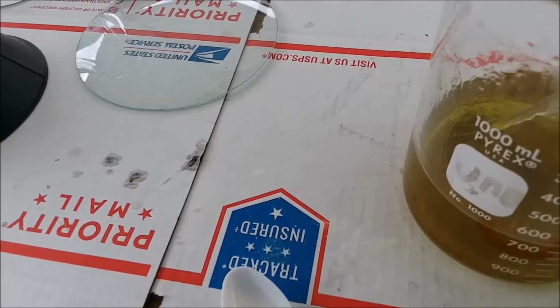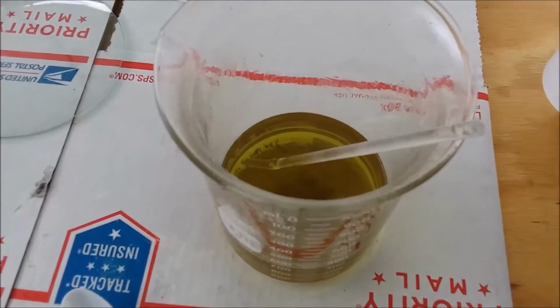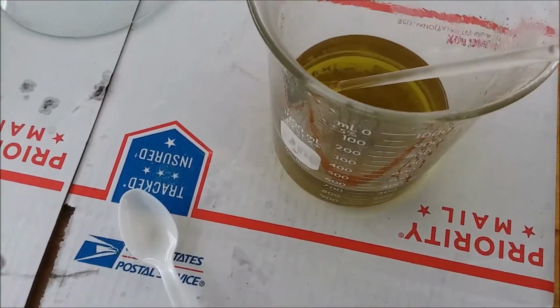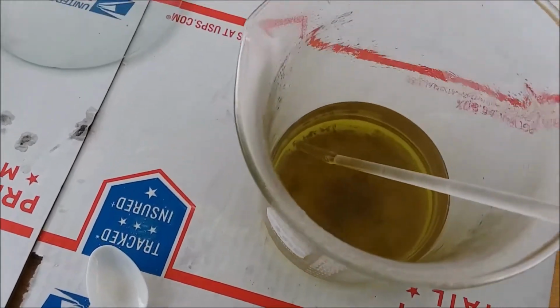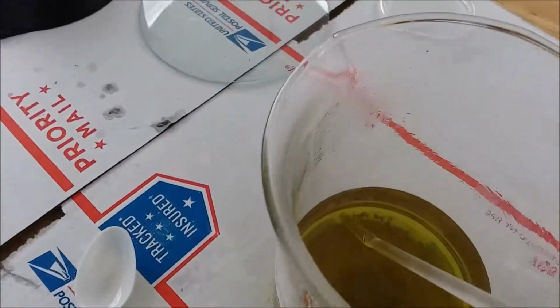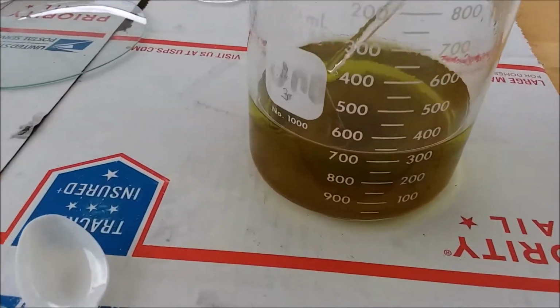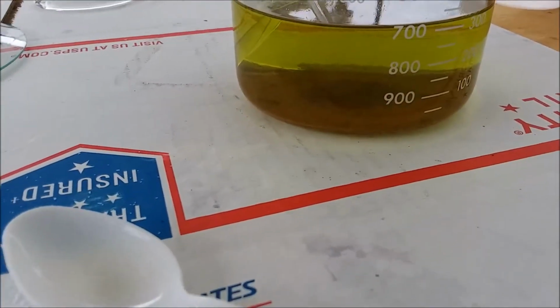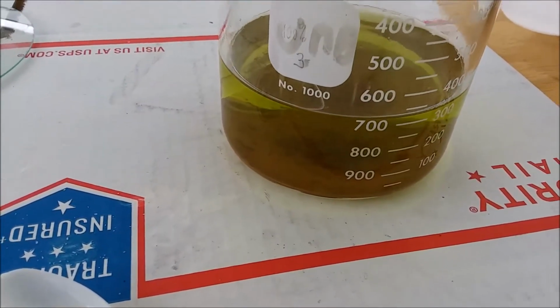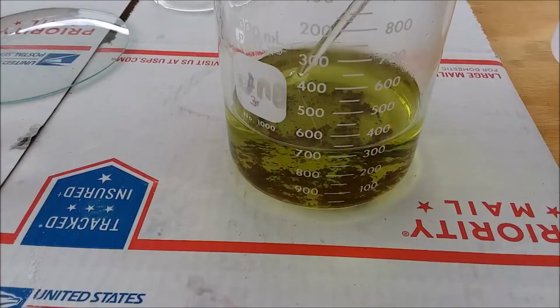Okay, I will need to do a stannous chloride test to make sure that all of the gold is out of solution, but wow, look how fast that dropped. I've never seen it drop that fast before. So, well, maybe better. Let me get the stuff to do a stannous chloride test.